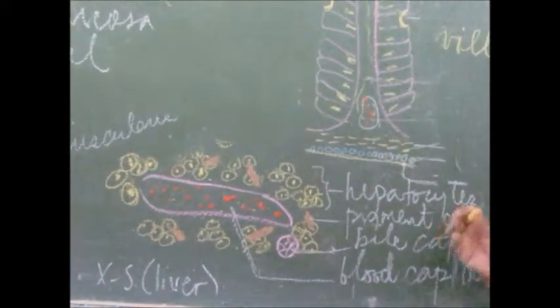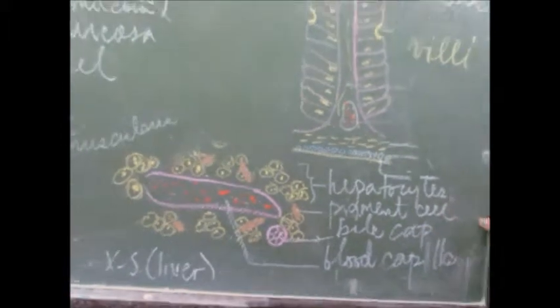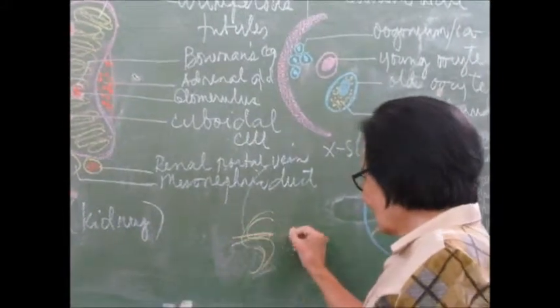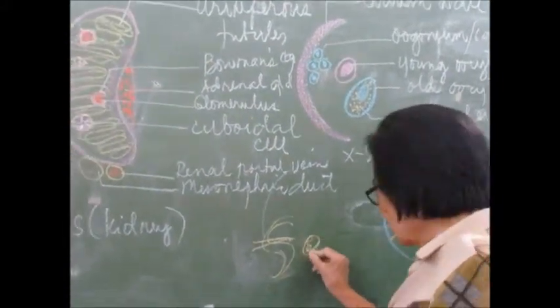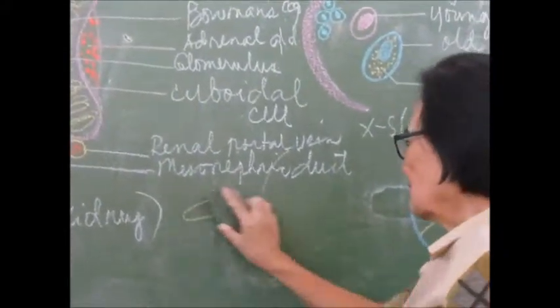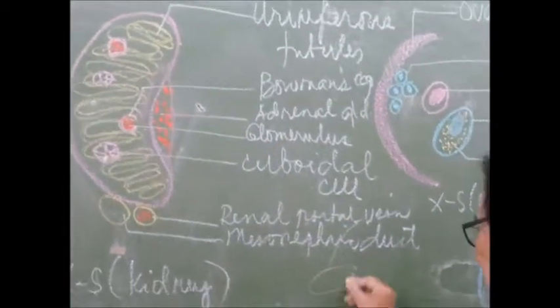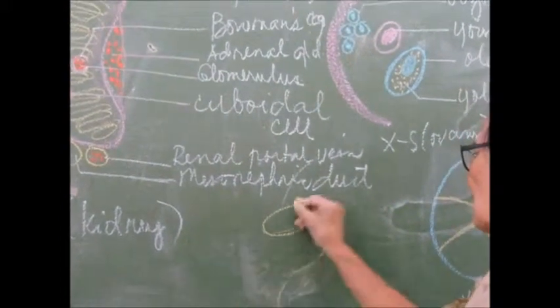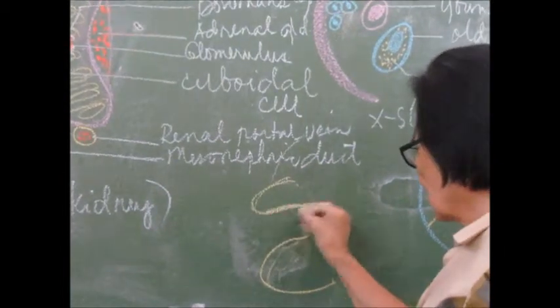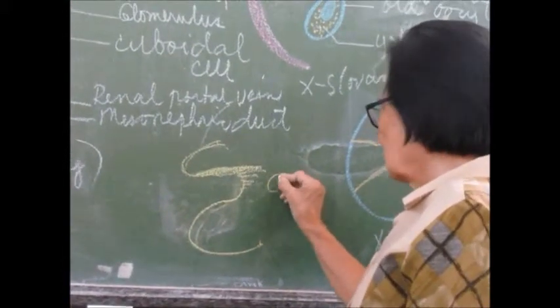Now, we go to the urogenital system, which again is all focused. You kindly turn the blackboard. Tiny tubes. So, if it is a tube, the cross-section is always round, correct? With a space in the center. However, because it is coiled, and we have millions of these tubules in our kidney. Now, if the section falls under this portion, it becomes round, correct?